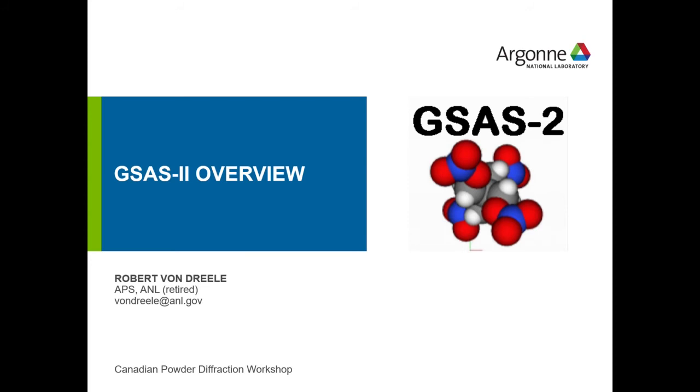Okay, this time I'm going to talk about GSAS-II in particular. A couple of remarks before I start. This was written because the old GSAS program had its limitations. It wouldn't deal with more than 99 powder patterns, or histograms as we call them, and no more than about 9 phases. And there were people whining about how it didn't deal with enough of either one of those. It was very difficult because of its design to expand beyond what it is.